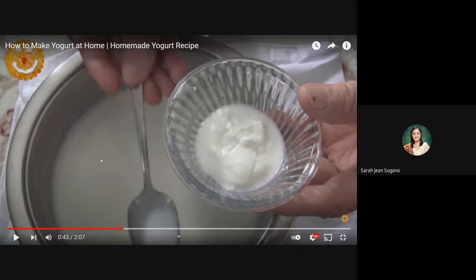So if your milk is still hot, the lactic acid bacteria will be killed, so it won't grow. So there will be no yogurt that will form. Okay.